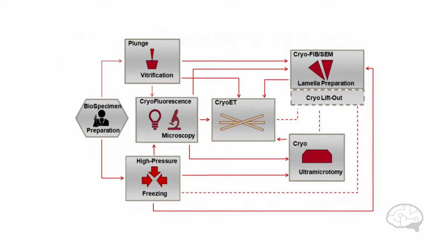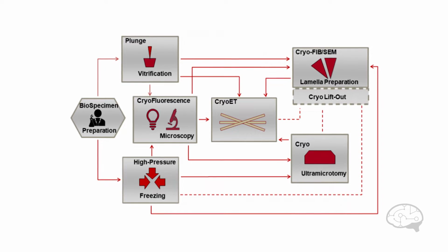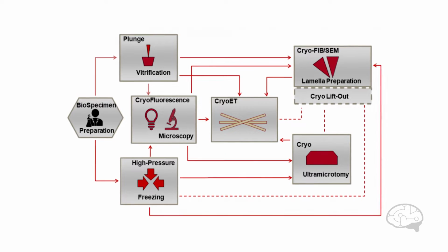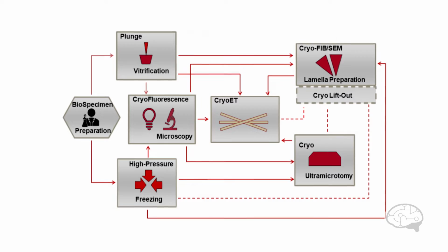So you're offering training, and you also have instruments available. What kind of instruments do you have available for people to use? I would say there's probably 4 different classes of instrumentation. When you're first coming in, the most important thing is sample prep. You might be coming in with cells, viruses, or some other target for cryo-electron tomography. So we have cryo-plunge freezers, high-pressure freezers, and automated freeze substitution equipment. All of those can be used for that initial step of preparing your sample for imaging.